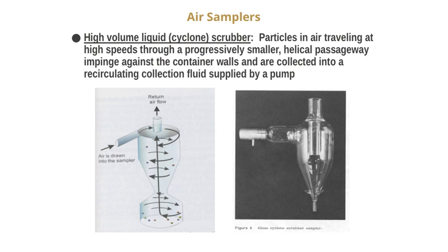This method is quite efficient for sampling large volumes of air and capturing airborne particles, making it a valuable tool in environmental monitoring and workplace safety. Overall, the cyclone scrubber exemplifies how we can use physics and engineering principles to improve our ability to measure and control airborne contaminants.